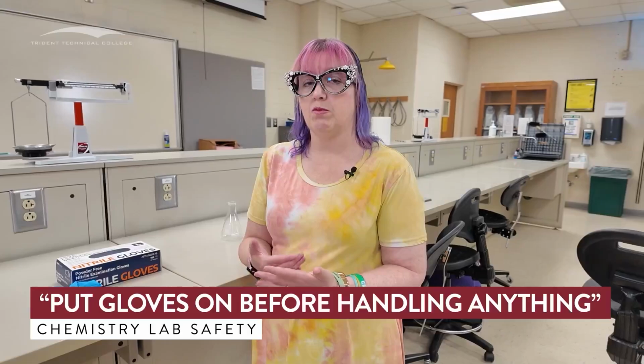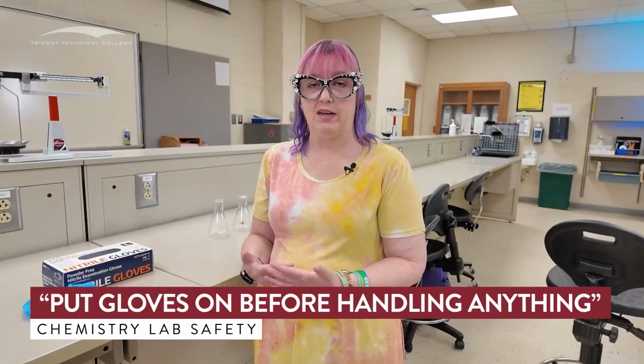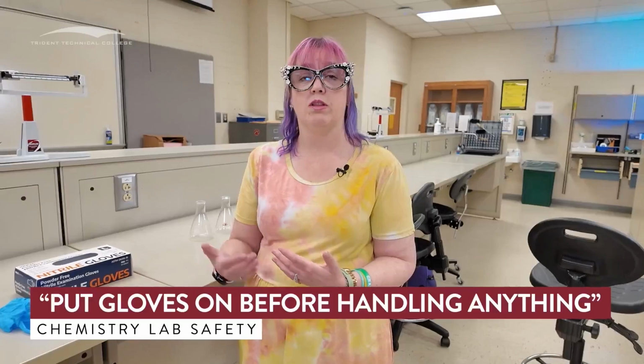Chemicals can be just about anywhere, so we want to make sure that we're dealing with clean hands before we put them back into those gloves. Things that we need to make sure of when we talk about these experiments: we put those gloves on before we handle anything, because you may not be the first lab for that week. So the things that we're dealing with may not be as clean as we want them to be.